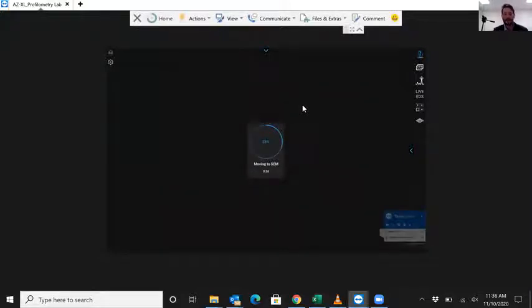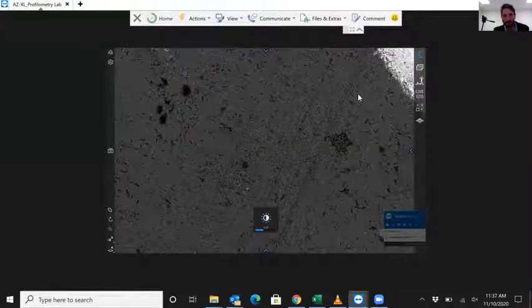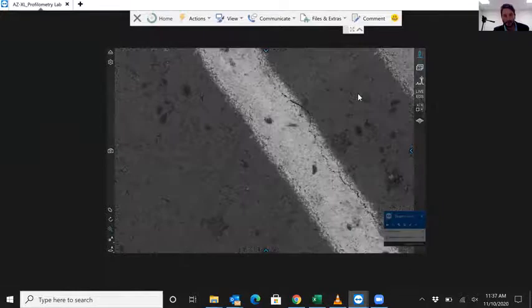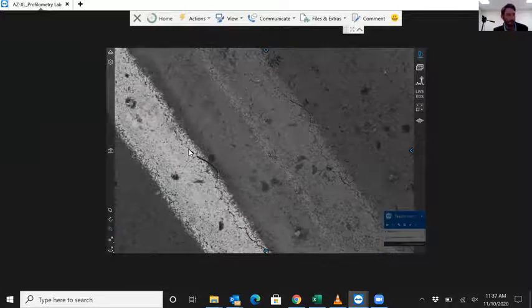The reason it's so fast is because it is a relatively small volume we're pumping out, and the system is differentially pumped as well, which helps with that pump down time. So once I get into SEM, I'm going to make a couple of moves, show you how easy it is to move around. You can use the arrow keys on your keyboard, or I can just click with the mouse. When I get in there, it'll help us do an autofocus. And then I'm clicking on the screen. Whatever location I click is where it's going to center our field of view.